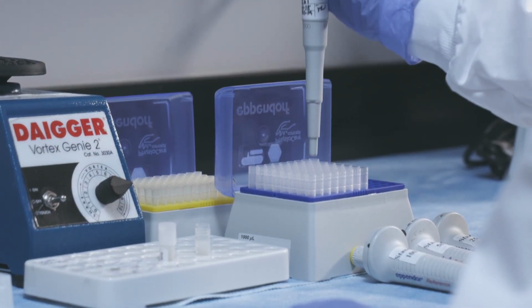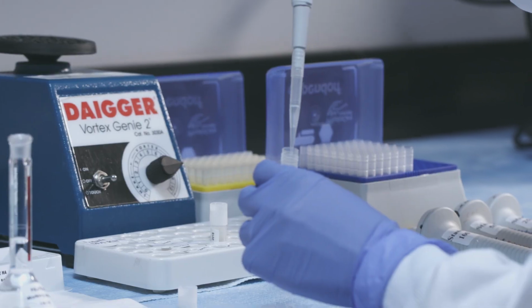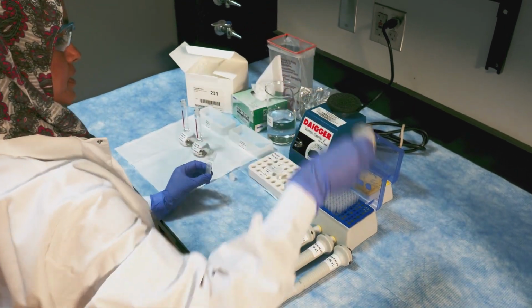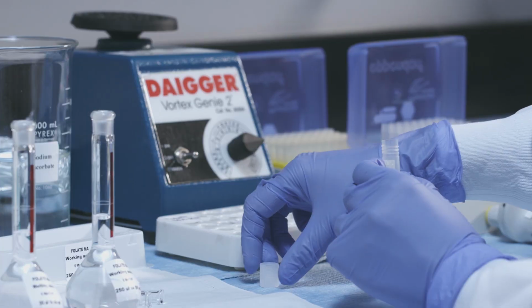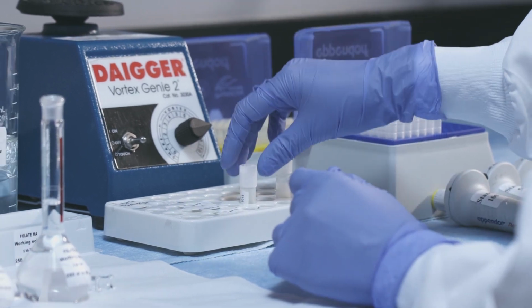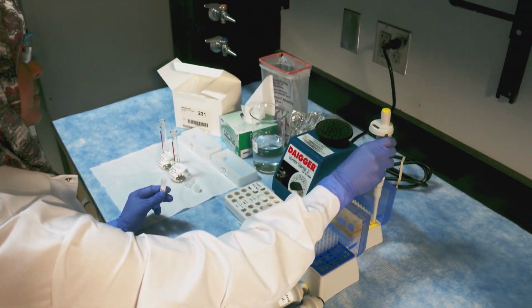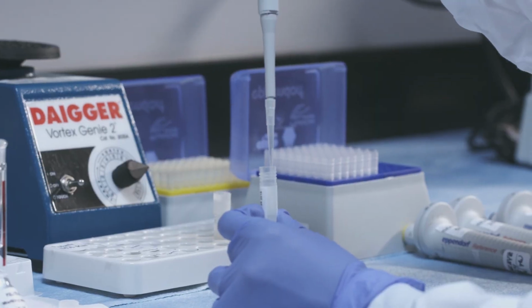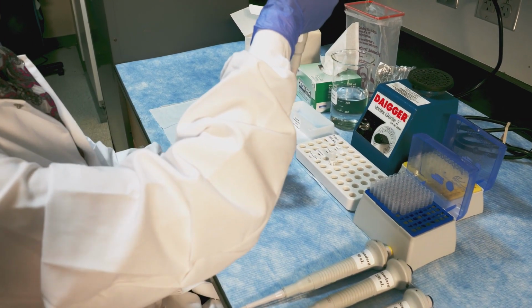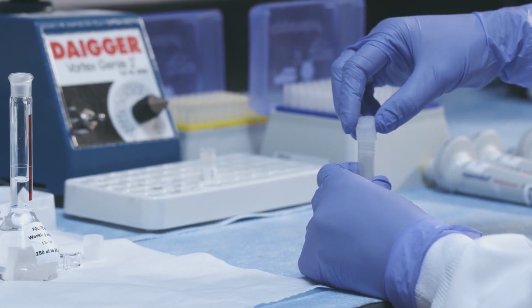To prepare a 1 to 5 diluted stock solution, add 400 microliters sodium ascorbate to a 2 milliliter cryo vial. Then, add 100 microliters calibrator stock solution and mix well.